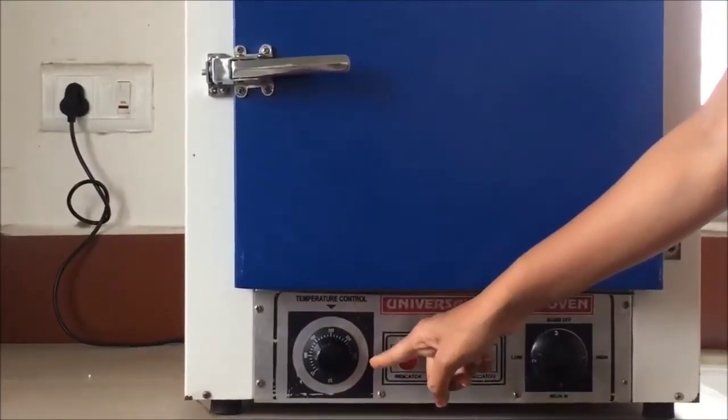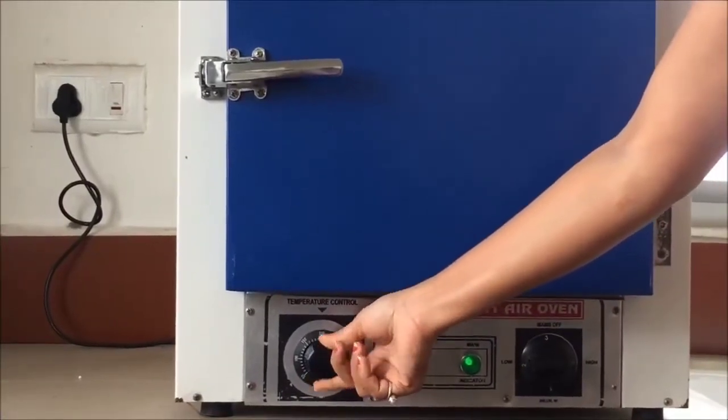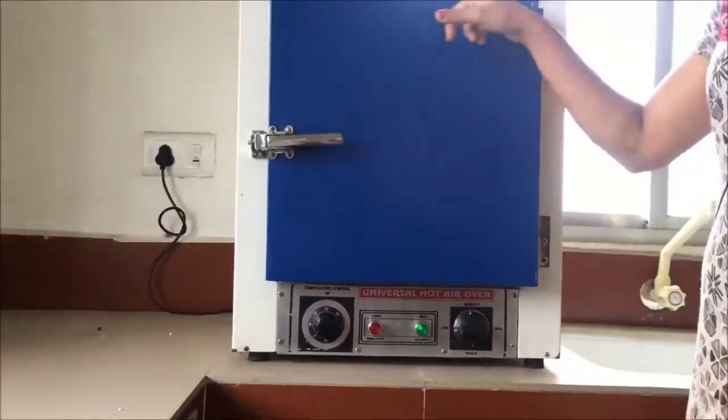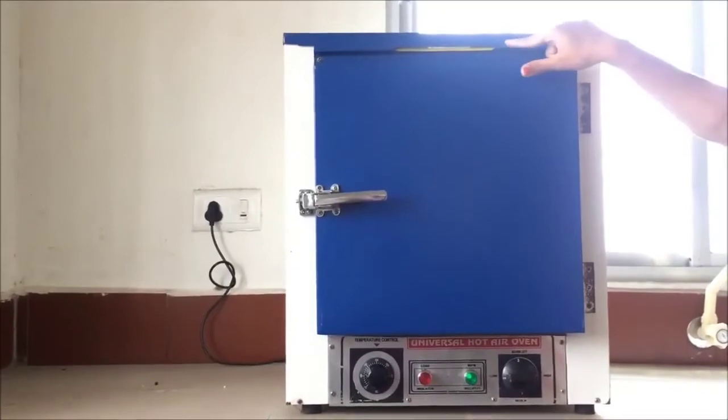This is the maximum point — it depends upon the oven type. If you turn the regulator to the left side or anti-clockwise, it will reduce the temperature accordingly. This is the thermometer — an analytical thermometer — at the top of the hot air oven.